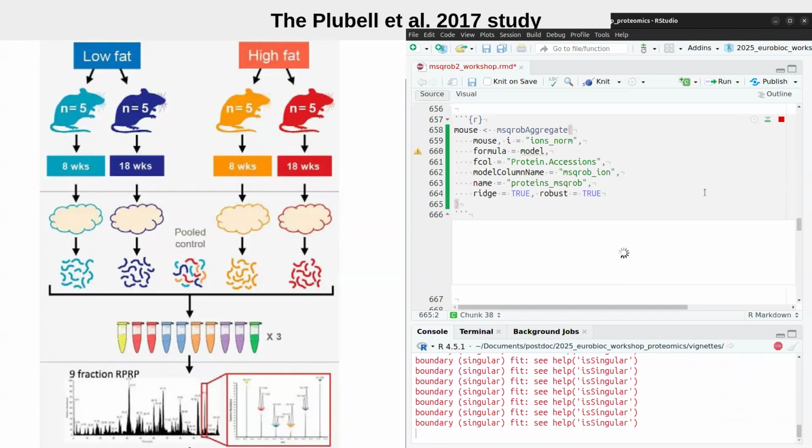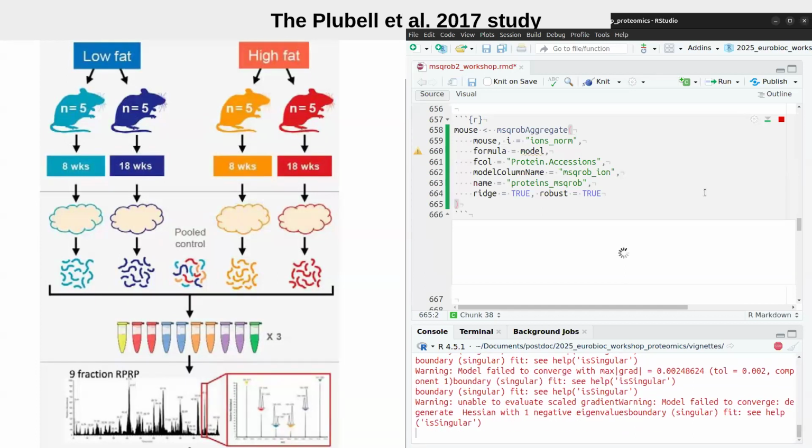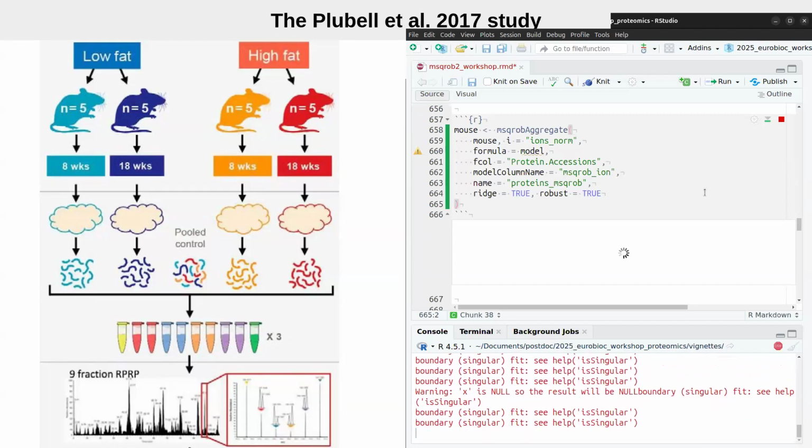Yeah. So I will just show. Indeed, I didn't mention it, but I will provide two scenarios: aggregating at the peptide ion data, or you can also model at the protein level data. That's something that we started to do, when sometimes we started to model the data and see that it is having high variance.